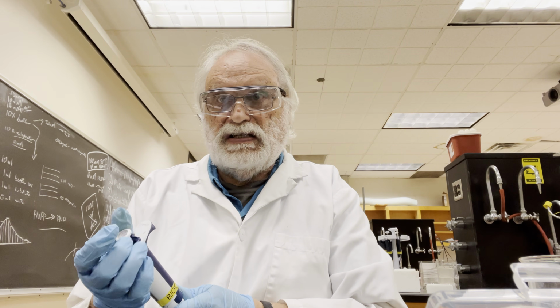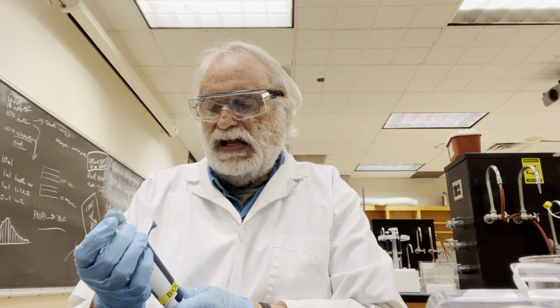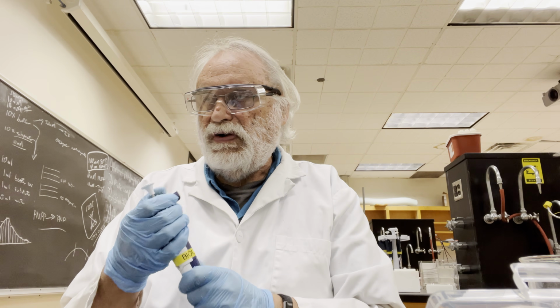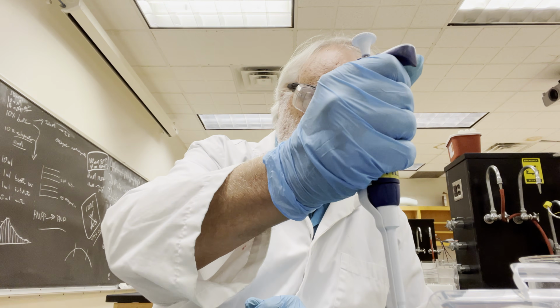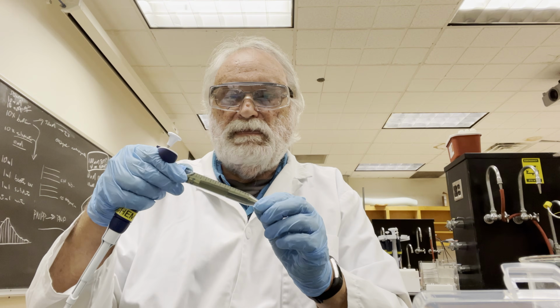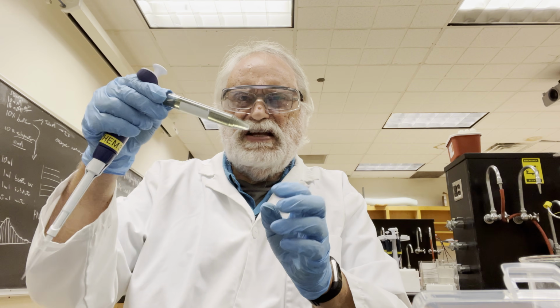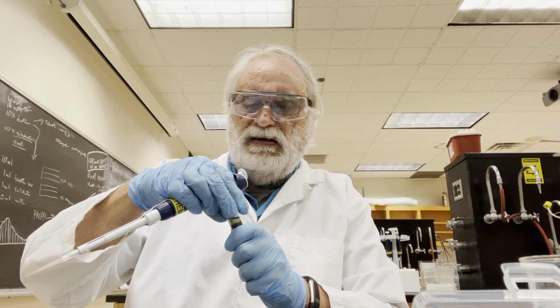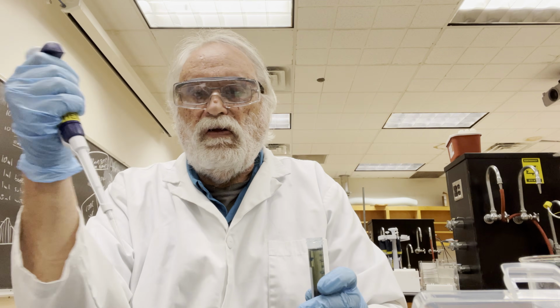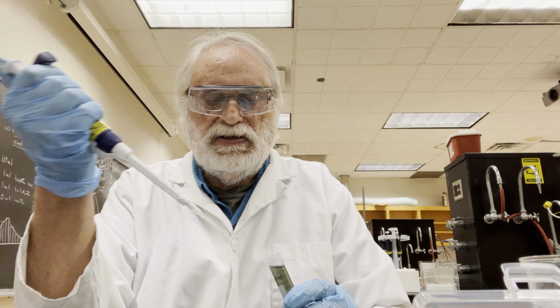Unfortunately, the reagent isn't here right now as I film this, so I'm going to go ahead and use the Bradford reagent. I don't care for it as much. I think the BCA assay is a superior assay, but since we don't have it, we can't use it. Hopefully, you guys will not be using it. So here's the Bradford assay. The reagent looks a little bit light. It's homemade. We'll have to see how it works. So what we'll do is, all the wells that have samples in them, I will add 200 microliters of reagent.